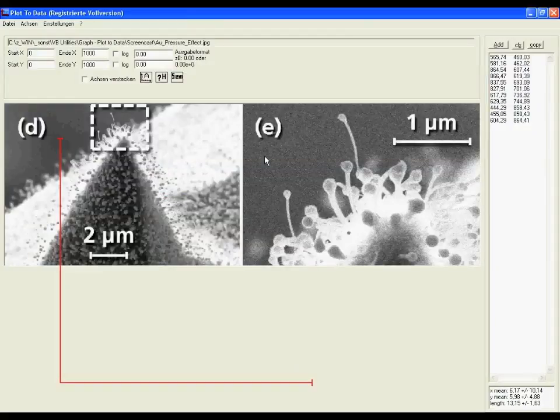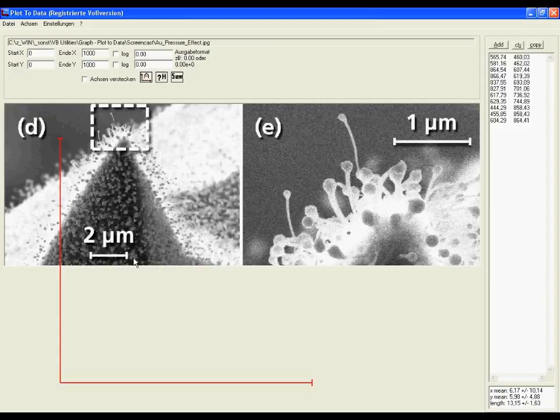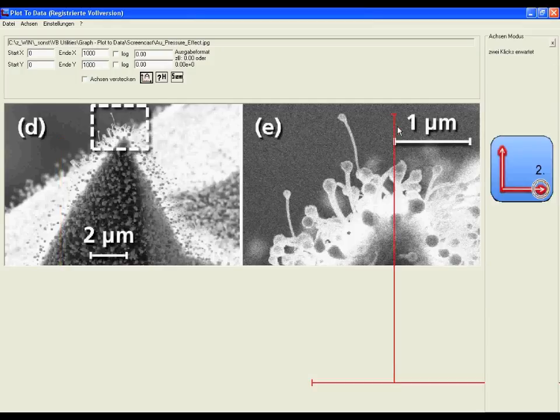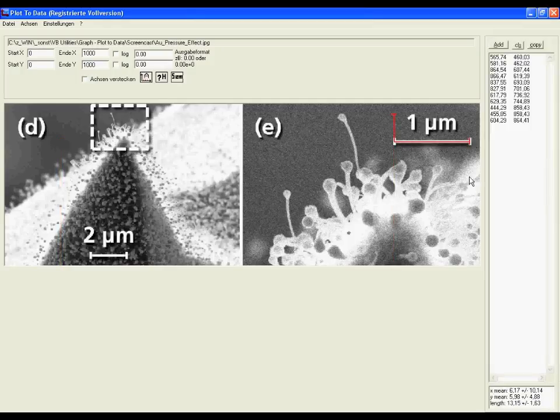Another example what I particularly use the plot to data for are SEM images where you just have the scale and later you want to know how big is something. So again you press A to adjust the axis and you say the start is somewhere here and the end is somewhere here. And then you can with the arrow keys adjust the scale and you just know the x scale and you don't know the y scale.